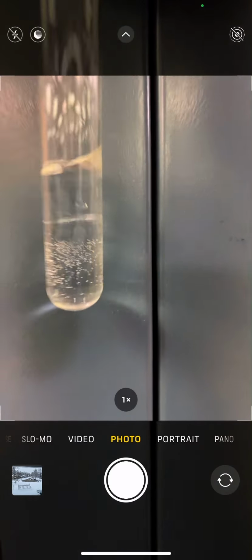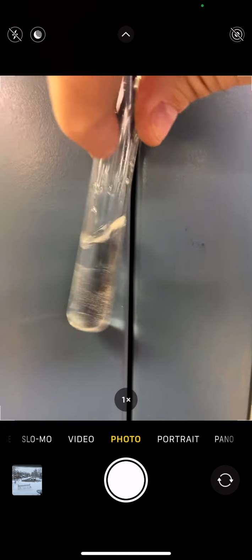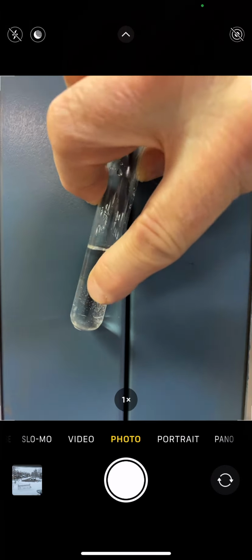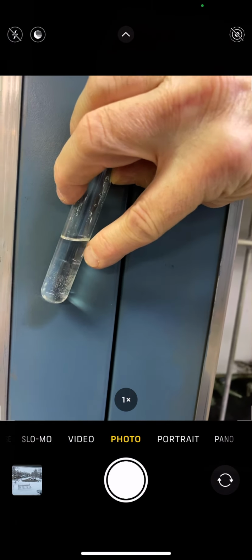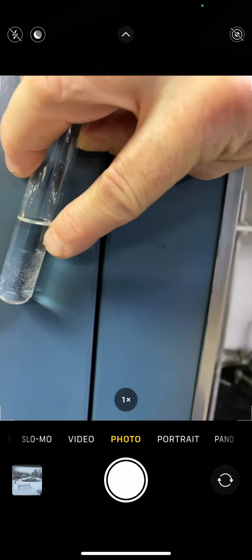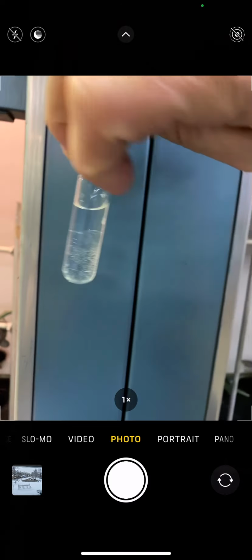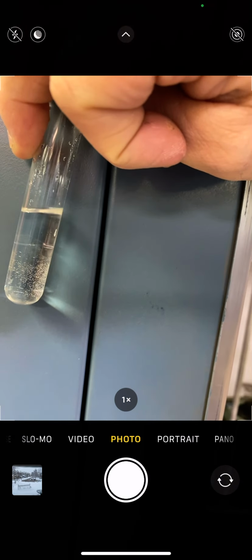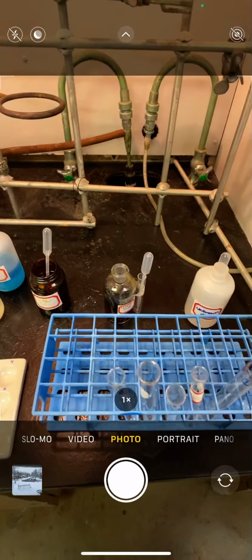I don't know if you can see that very clearly, but there is a line. There's a line separating the hexane on the top here, and water on the bottom, right? Most organics tend to be less dense, so they float in water, just like a cork floats in water. A few that are like highly halogenated, they would sink in water, but definitely you see 2 layers there. So hexane, because it has no polar functional groups, right, it does not dissolve in water. So we've ruled out 1 possibility for your unknown.